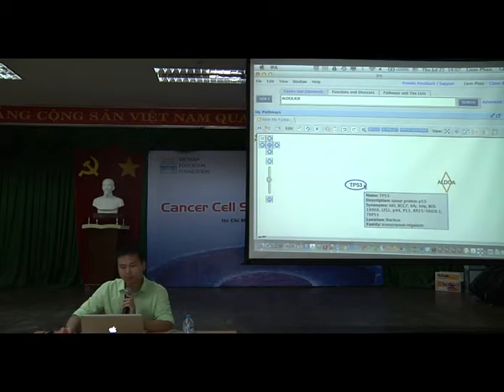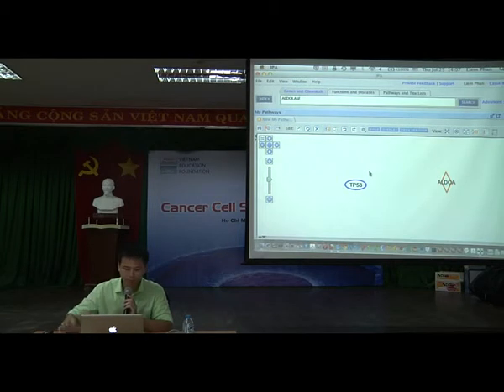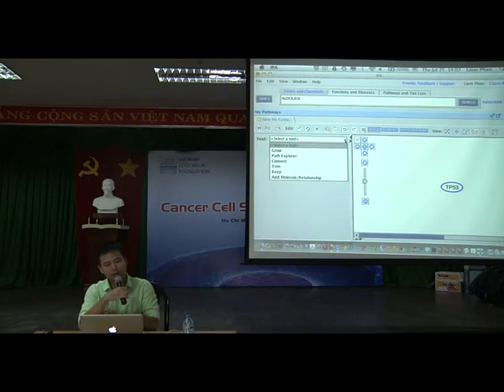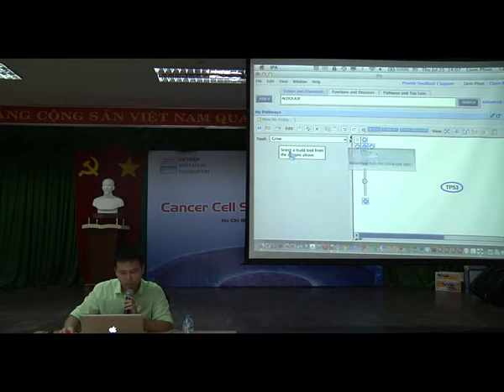So now, if I would like to know what are the downstream effects of p53, I just need to click on p53, select it, and use the tool build. Here we have multiple, I think like 6 different tools. The first one is grow. For example, select grow.